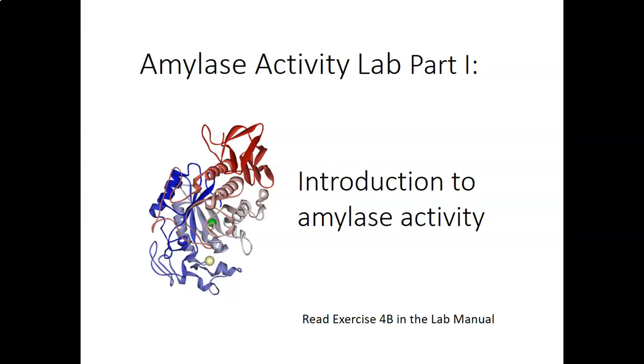We're doing the Amylase activity lab this week, and this is the first video, which is an introduction to amylase activity. Make sure you read exercise 4B in your lab manual, especially the part where it's introducing enzymes and how they work, and specifically talks about amylase and the type of assay we'll be doing. That will be a very good introduction to this lab.